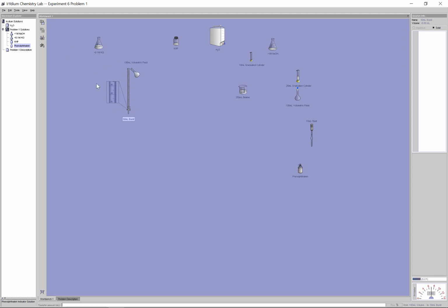Let's pour in, let's say, 35 mils. Right? It could be something totally random. You're just going to need to take down what your initial reading is. In this case here, it's between 16 and 17, so let's go 16.22 is my starting reading. This time, I'm just going to demonstrate for you here. You could also do a titration. So far, we've done a 10 mil pipette. You saw that our titrant volume was somewhat less than 10 here.